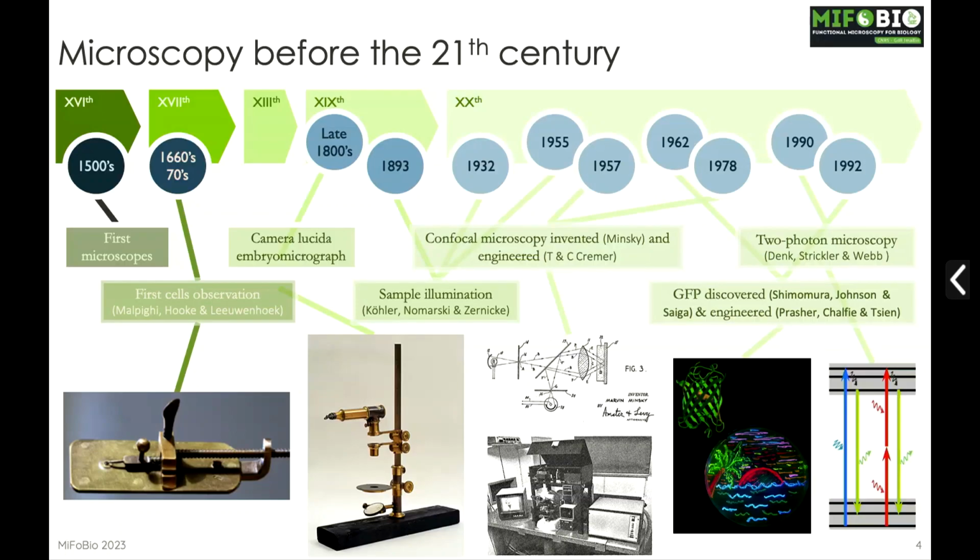it's almost an idea without the possibility of making it, but Marvin Minsky already thought about what could be the confocal microscope at that time. He just missed the lasers that came a couple of years later, and then all together that enabled people to build the first confocal, laser scanning microscope.